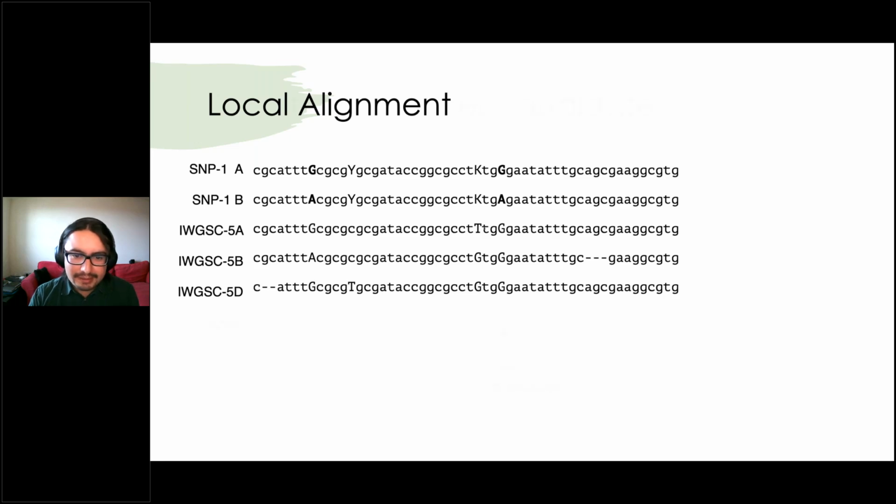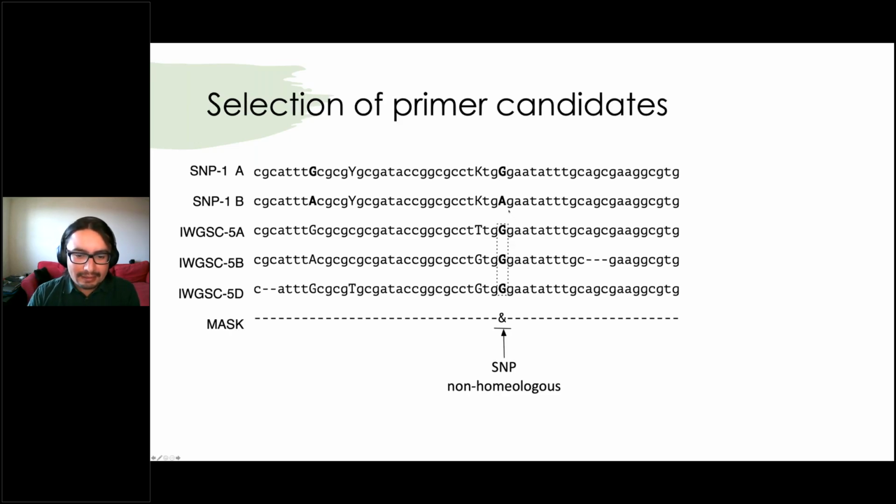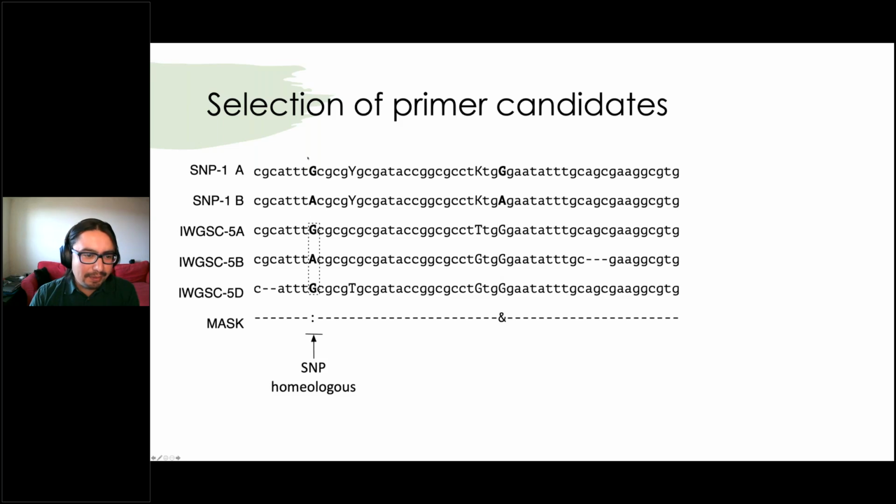The first thing that you want to check is that the SNP is actually a SNP, because it can be, like in this case, where there is another possible SNP here between the two markers that we are checking or selecting. But you can see that this SNP is not likely to be a real SNP. It's more likely to be a regular variation between the three genomes. So one of the things that PolyMarker does is to find these cases. So you know that if you have problems in your analysis downstream, it may be because of this. It doesn't mean that the marker doesn't always work, but it can give you an indication. So usually we discard these cases.